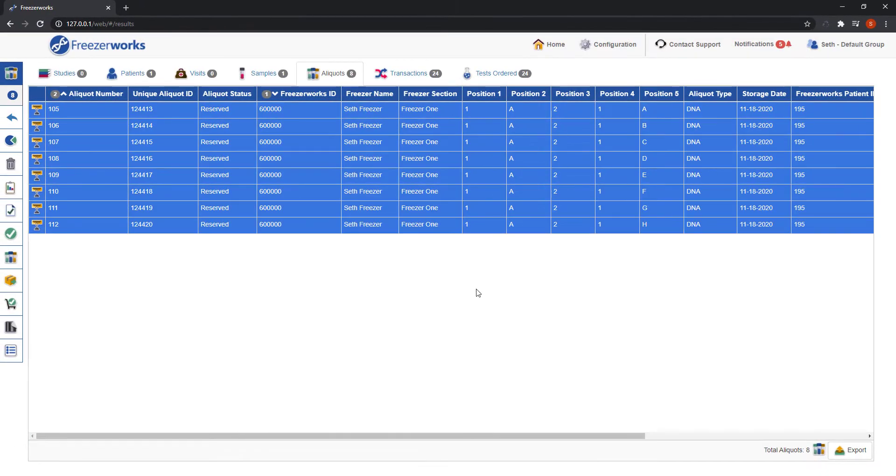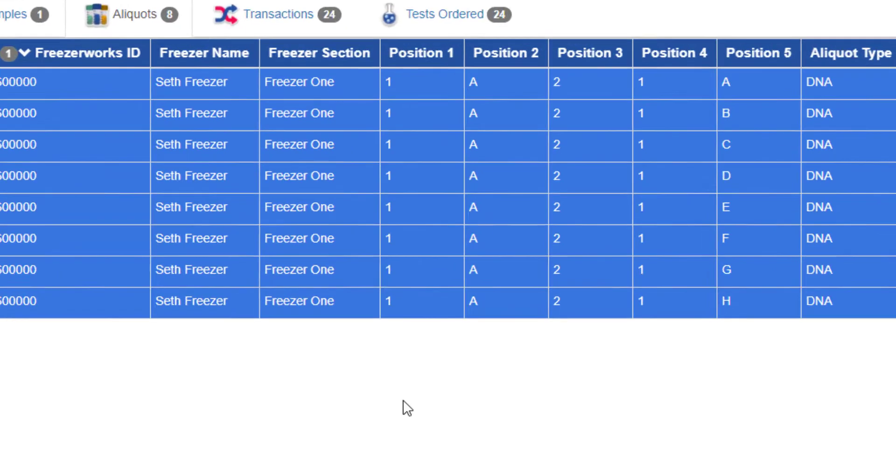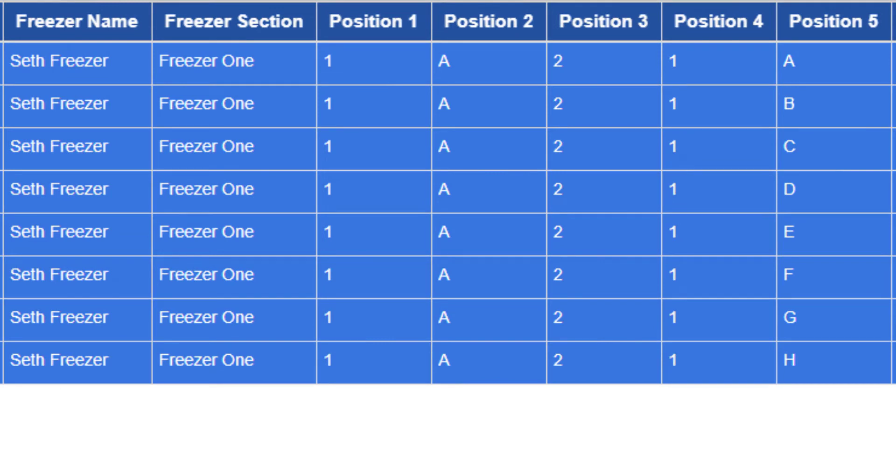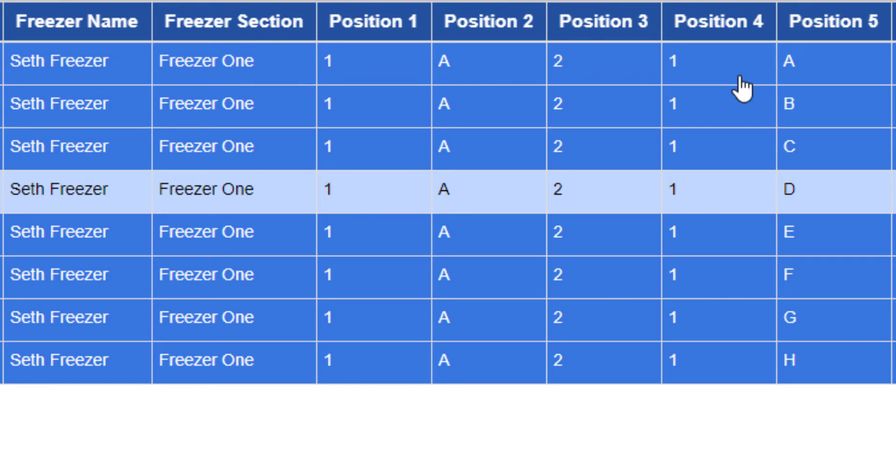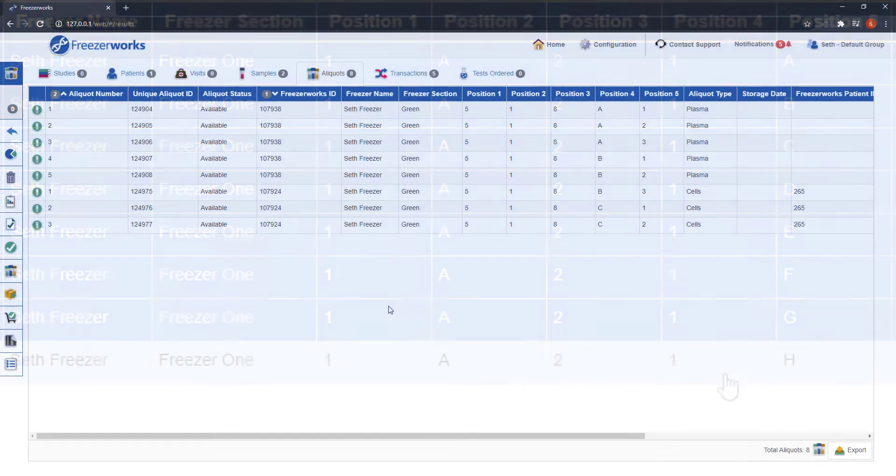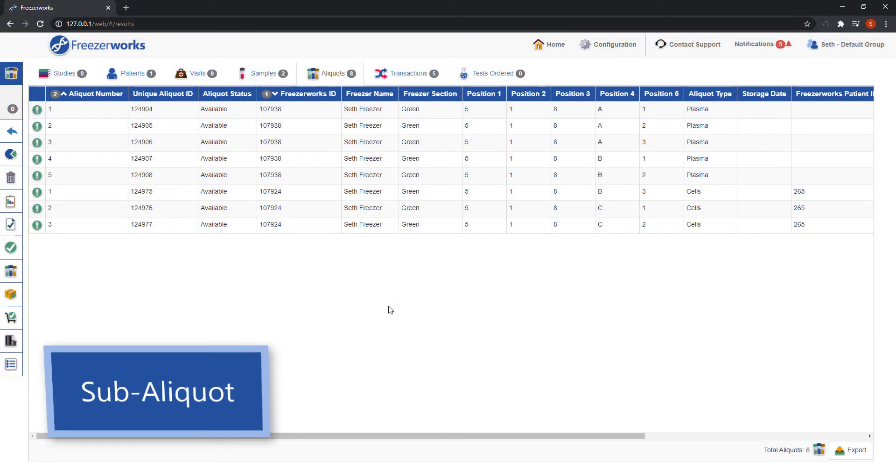As you can see, my aliquots were placed into the new freezer, but their final position values remain the same. Next, let's imagine we need to spin these aliquots down to make more. So it's time to run a sub-aliquot workflow.